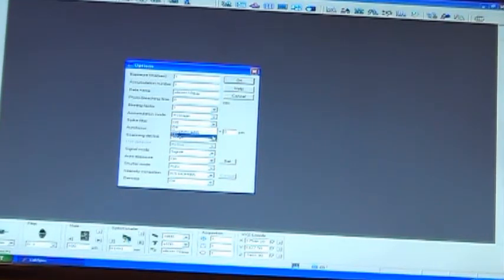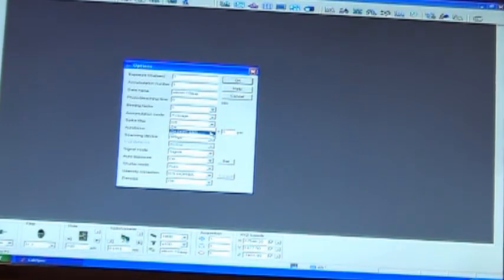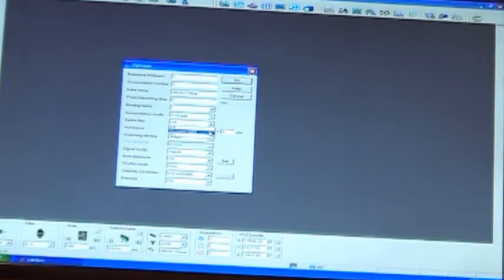It would assume that it's a spike or cosmic flare, and it'll take it right out. For on, you must have more than one acquisition for it to work, because it needs something to compare it to. Then we have on auto add. On auto add means if you put the auto add on for the spike filter and you go to take 1 acquisition only, the computer will actually go, no, you need 2 acquisitions. And the computer will automatically take a second acquisition regardless of what you tell it, because it needs something to compare to in order to know what's a spike and what's not.